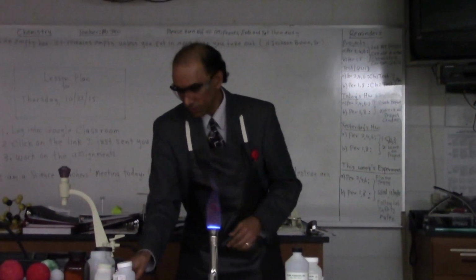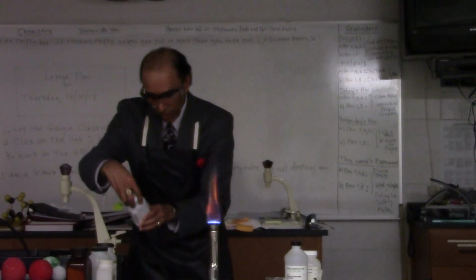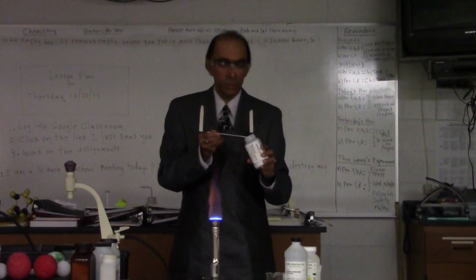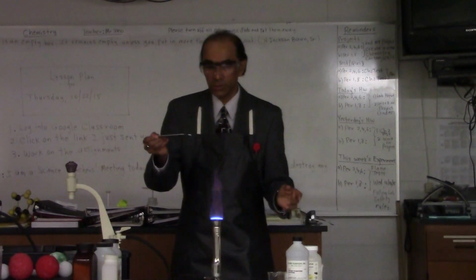All right, our third substance today will be lithium chloride. Okay. Lithium chloride. I'll take a small amount of lithium chloride, and the formula is LiCl. In the form of crystals.